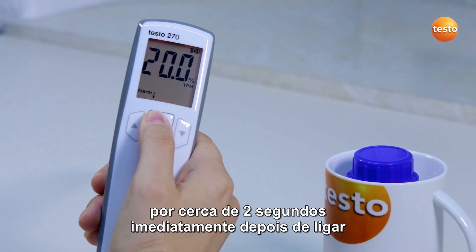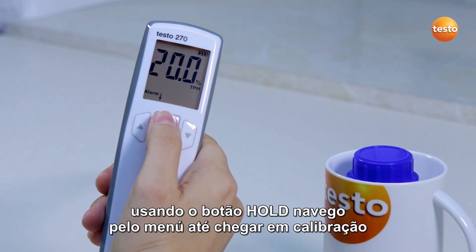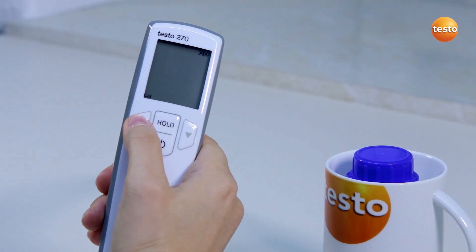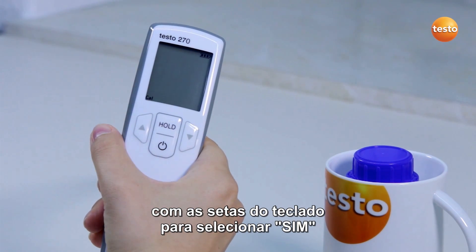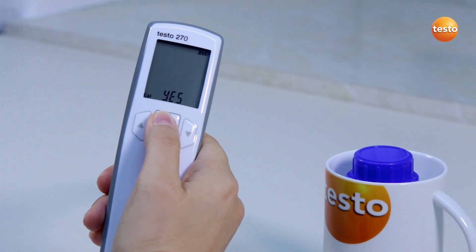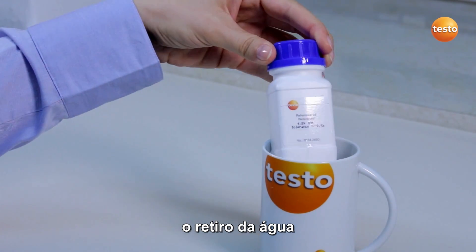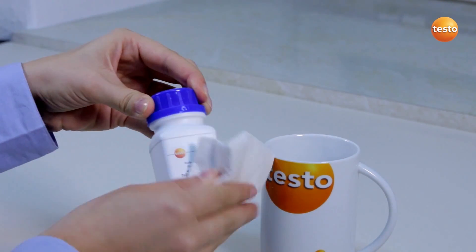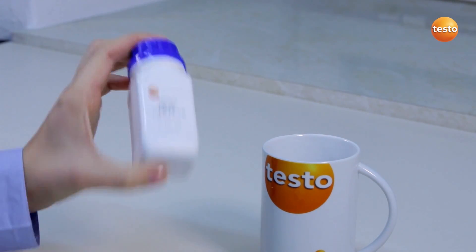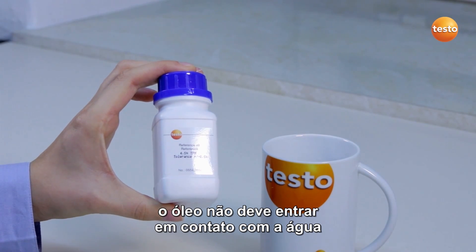I press the hold button for about 2 seconds immediately after switching on. Using the hold button, I navigate through the menu to calibration. With the arrow buttons, I select yes, and confirm with the hold button. Now the reference oil is warmed — I take it out of the water bath. To distribute the warmth more evenly, I briefly shake the bottle. Be careful — the oil may not come into contact with the water.